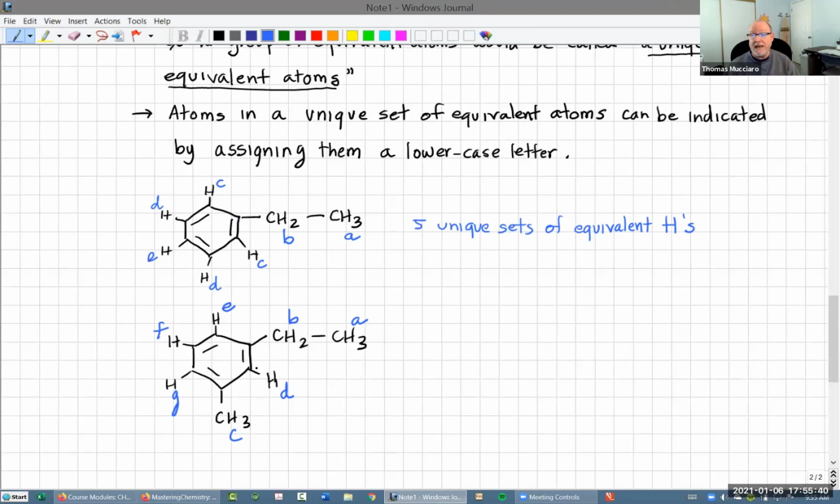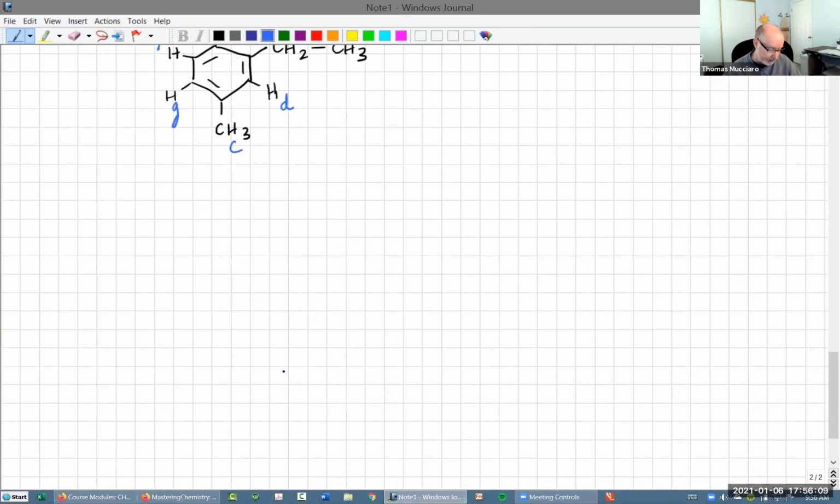Often in a weak NMR, we're not going to see a separate signal for each. They're going to kind of be blobbed together. But in a powerful NMR, and this is one of the advantages of a powerful NMR, the signals become thinner and thinner and thinner. So what happens is the blob separates, and we can literally see each one. Okay? So, all right. Now, next, integration.